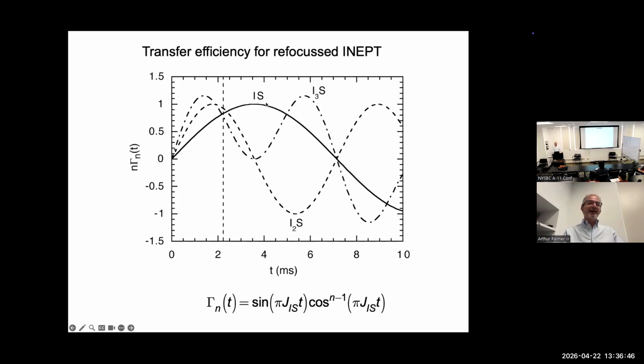If we just had an IS spin system, by now you're pretty familiar with the notion that the maximum intensity is going to be at 1/2J setting of the sine function. But now you have these much more complicated trigonometric functions to sort out. You were asked to do one by hand, but now, of course, frequently we just do it by computer calculation.